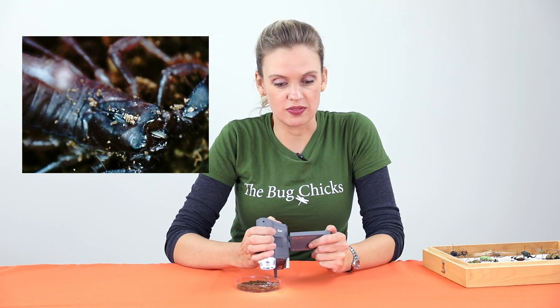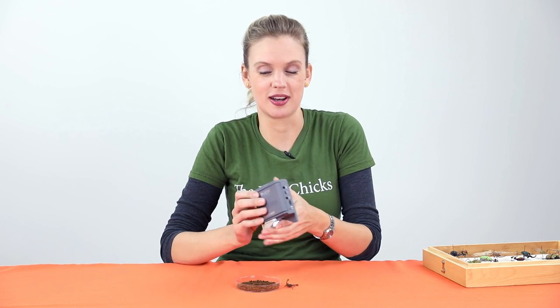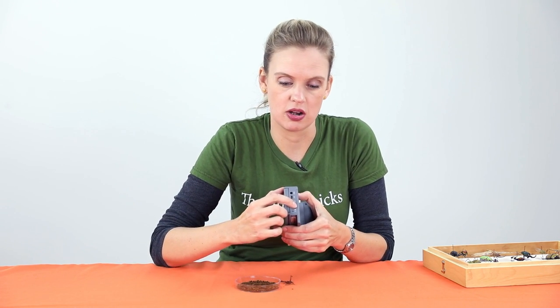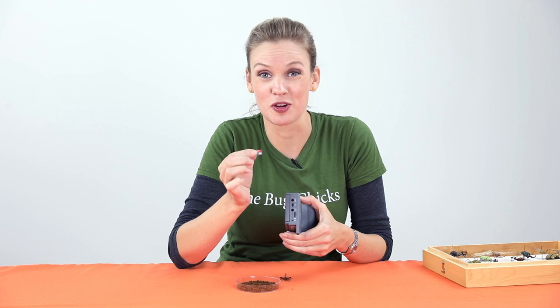So now that I've recorded some great video of the scorpion, I press the camera button again to stop it. On the back of the unit, we have this little micro SD card and it comes right out, and you can put this into an SD card reader into your computer and access all of your photos and videos.